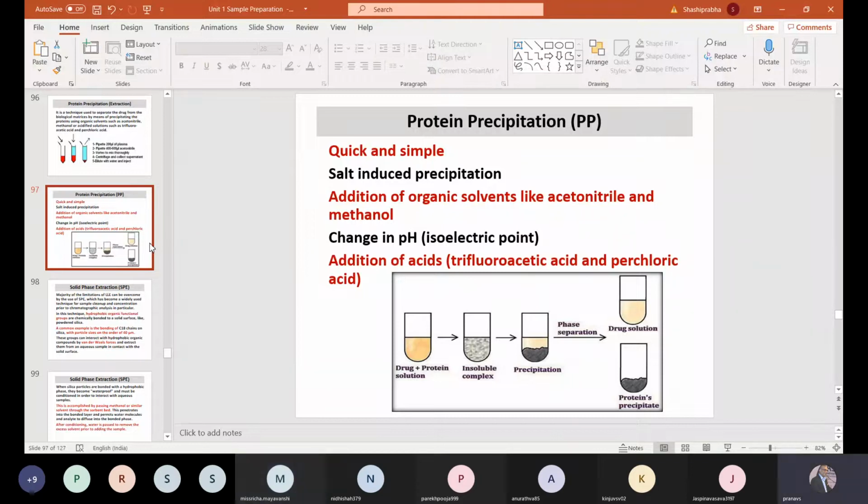Thank you. Just a very quick revision of what we did last time, or rather up till now. We have studied the importance of liquid extraction as a sample preparation technique. We also have some idea about Craig's countercurrent extraction, which is nothing but multiple extractions used for separating components which have very similar partition coefficients. One major advantage of that. And then we understood what is accelerated extraction. Basically, it's a closed system extraction.